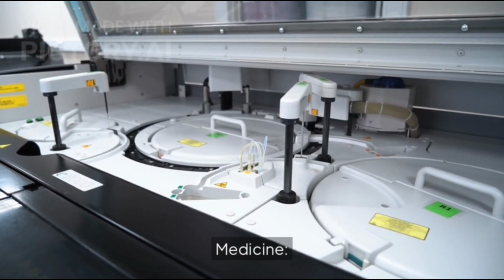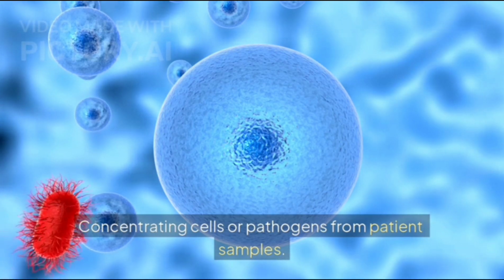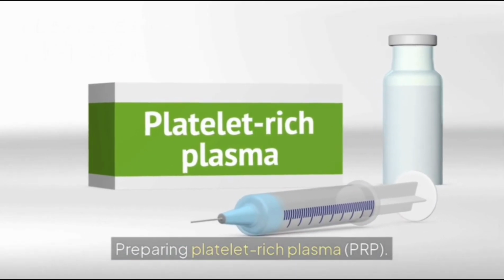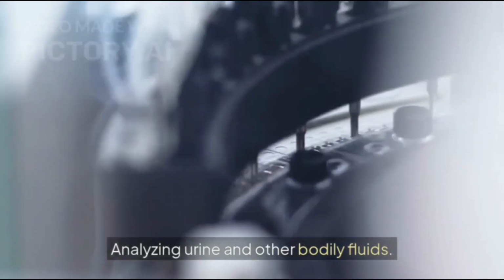Medicine. Separating blood components for transfusions and diagnostic tests. Concentrating cells or pathogens from patient samples. Preparing platelet-rich plasma (PRP). Analyzing urine and other bodily fluids.